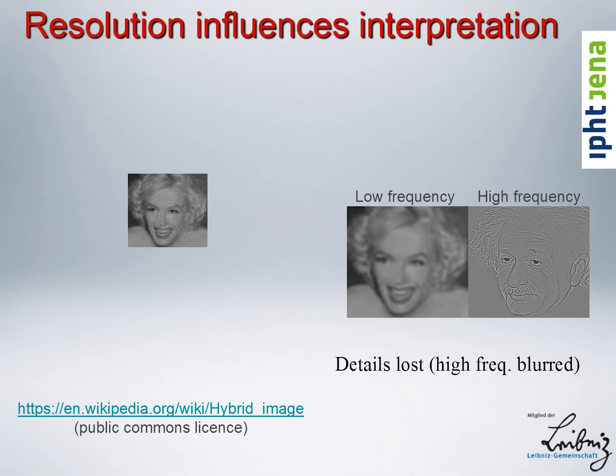In biology, there are similar phenomena when it comes to particular problems. When you have a higher resolution, you can see more details, and that might actually change your interpretation. For example, at low resolution, you will just see that two particular dyes, maybe a red and a green dye, are both localizing to the same type of cells. That's great. But then you zoom in, you get a better resolution in the end. So it's not just about the zooming, it's the resolution.